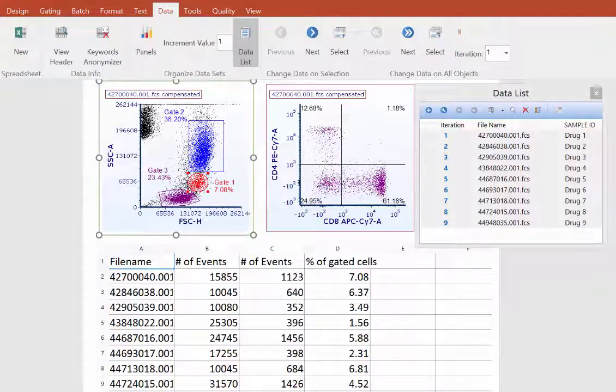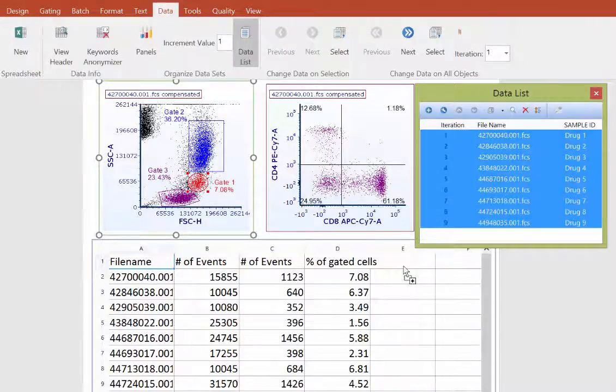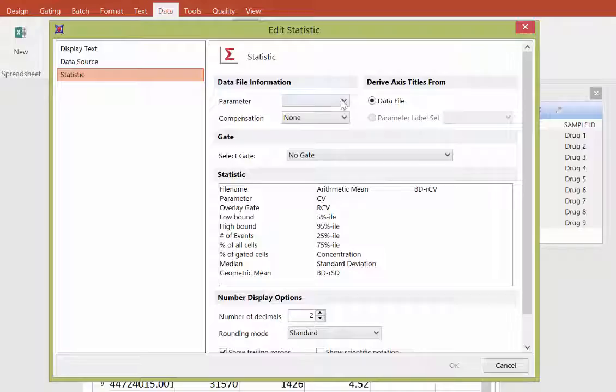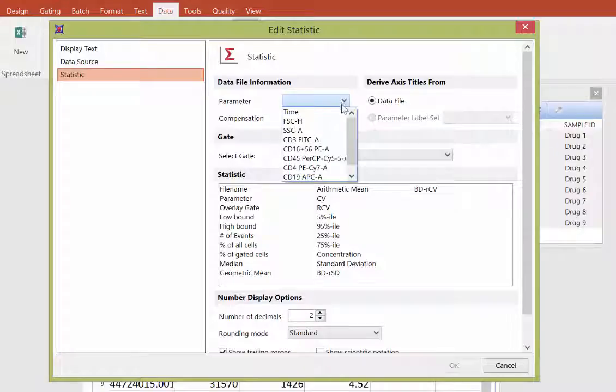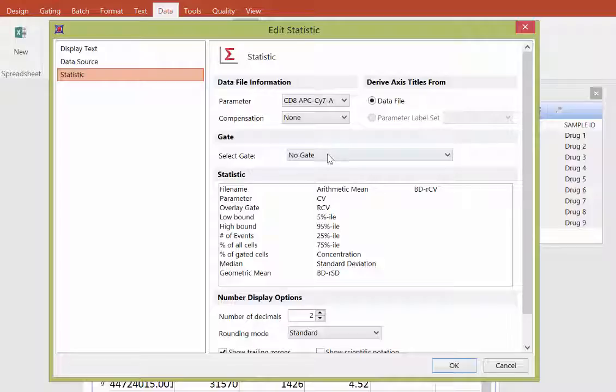Additionally, any parameter from your data file may be added separately with a drag and drop from the data list. In this example, we'll choose the CD8 parameter, we'll choose a compensation, and a gate of interest.